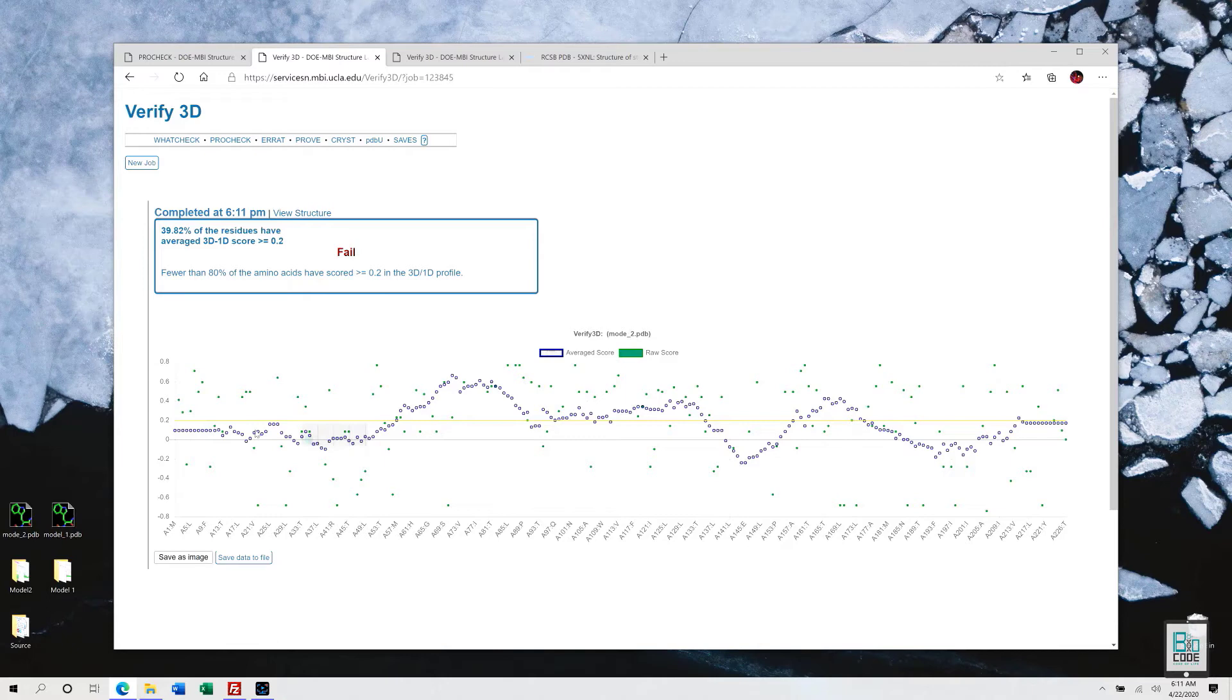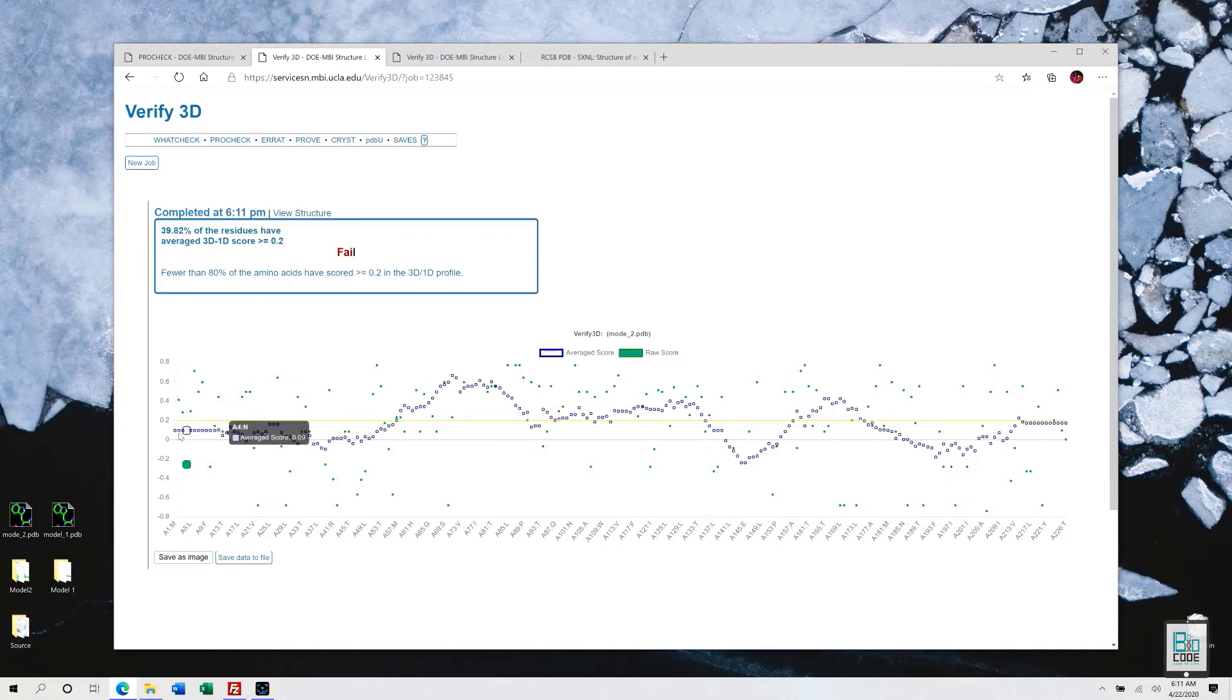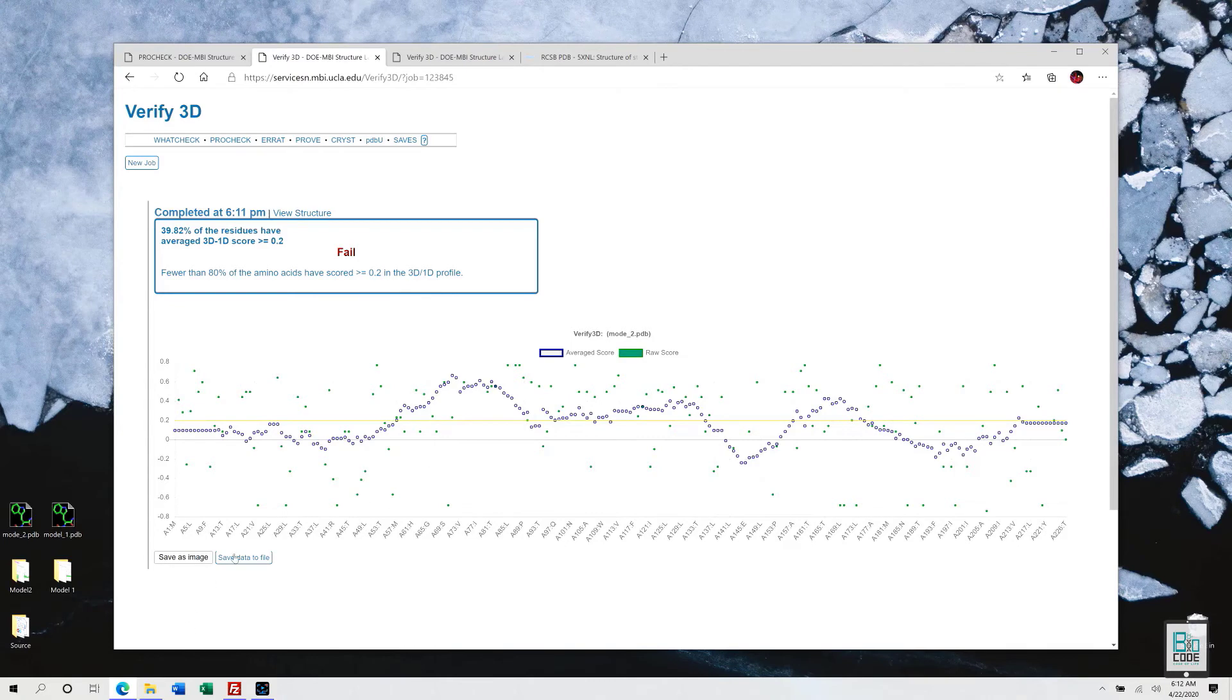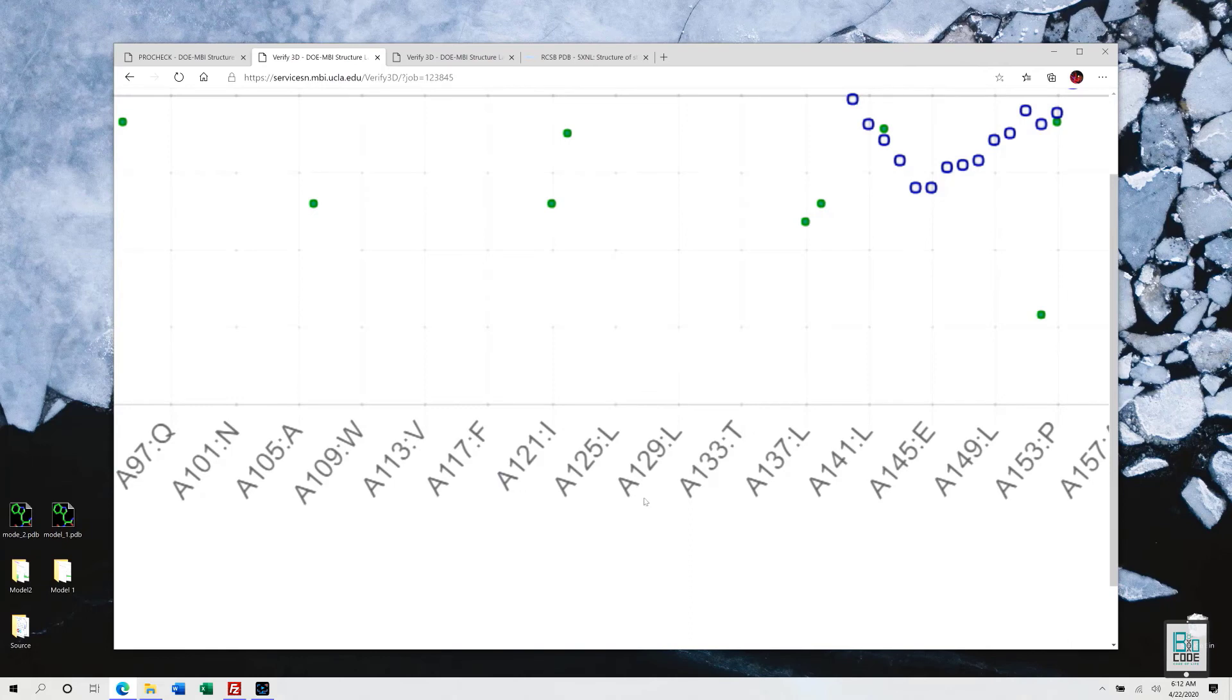Which is also interactive. If you hover over a particular dot, you can get the result of that particular region, of that particular residue. Every score is being presented in a blue dot scenario, and the raw score that is of our protein that we have predicted is in green color.